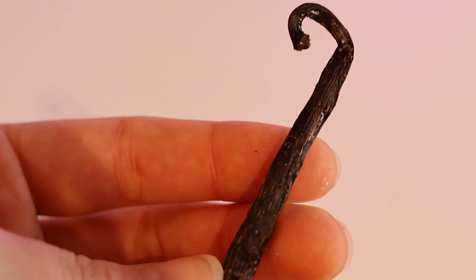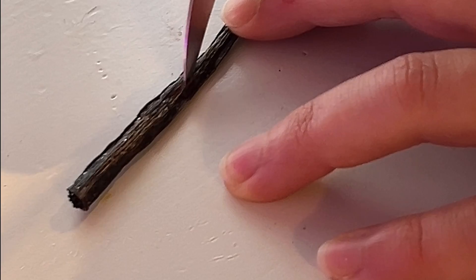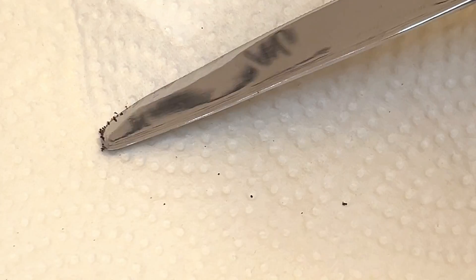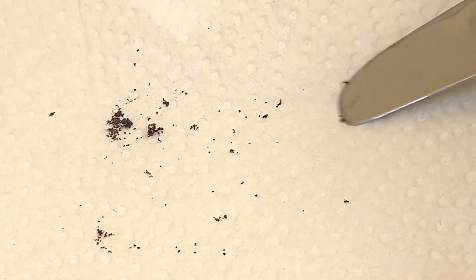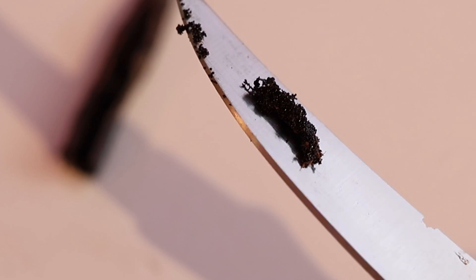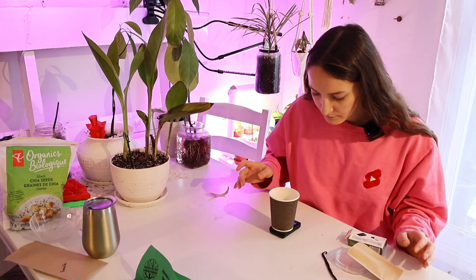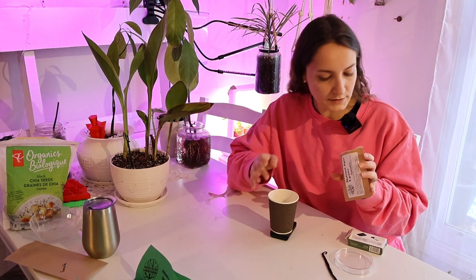So I got my hands on one and started my attempt at growing a million tiny vanilla seeds. On this channel, we don't believe in traditional scientific methods until we try all of the ways ourselves first. So when I tried it the normal way and they didn't grow like normal seeds and just mulled it over, I realized that I needed to put on my Bob the Builder hat and become a scientist to micropropagate these vanilla seeds with something called a culture or tissue growth medium.